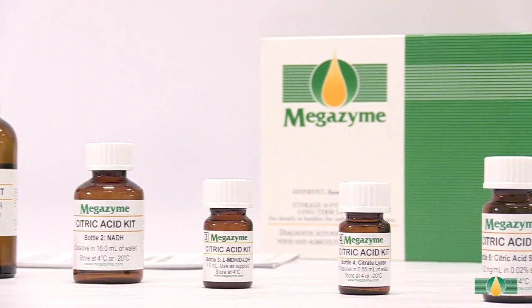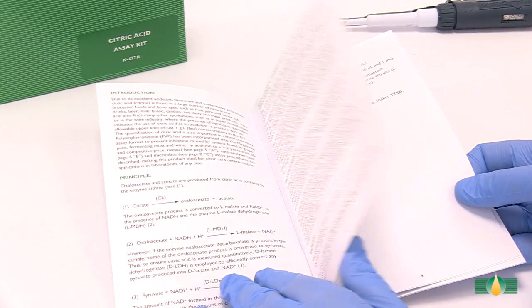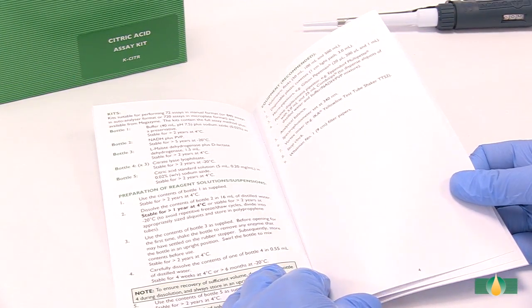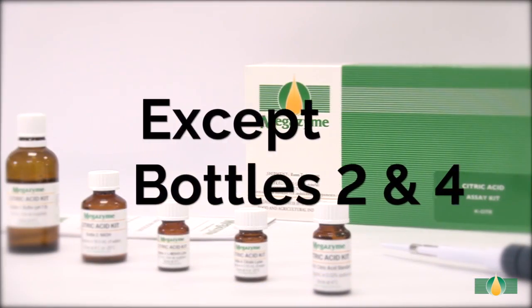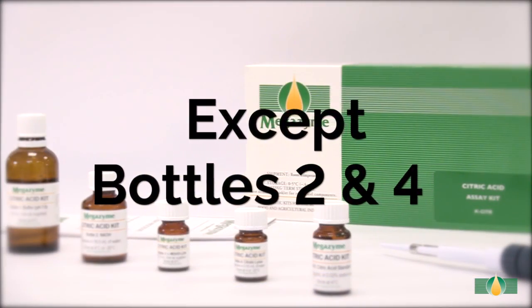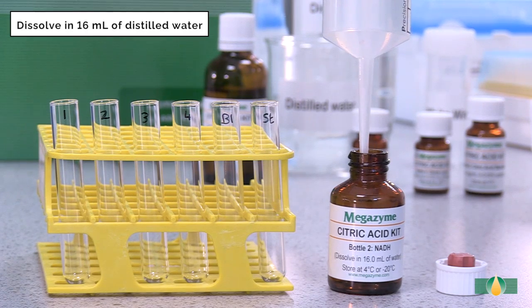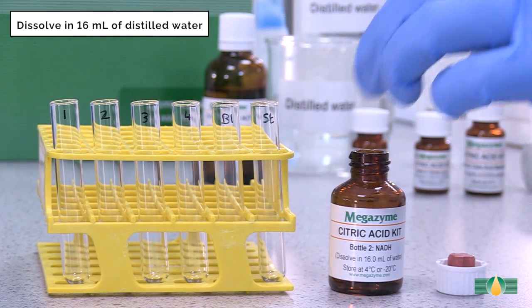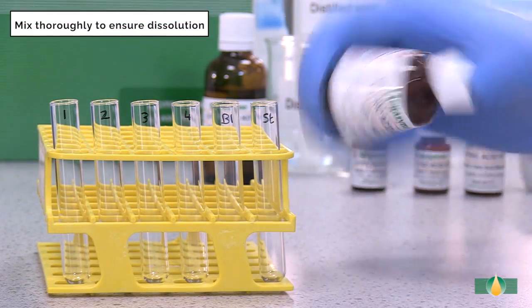Prior to sample analysis, the kit components should be prepared as described in the kit data booklet, and once prepared, they are ready for use in the manual assay procedure. All of the kit components except bottles 2 and 4 are used as supplied. The contents of bottle 2 are dissolved in 16 milliliters of distilled water. The bottle is capped and the contents are mixed thoroughly to ensure complete dissolution.